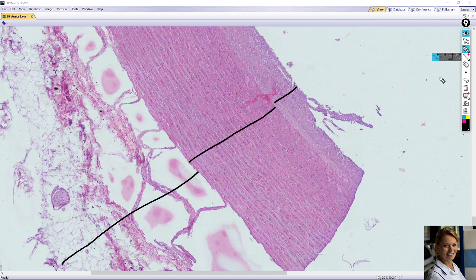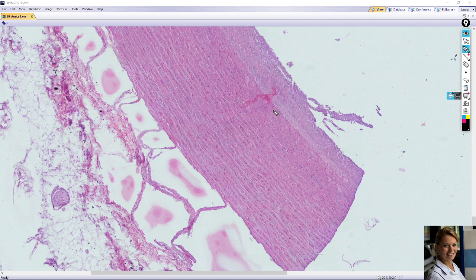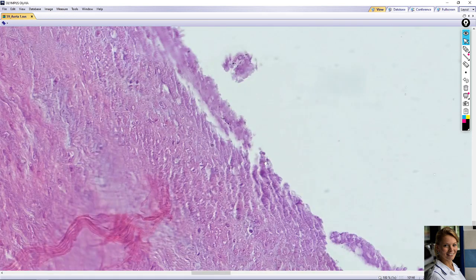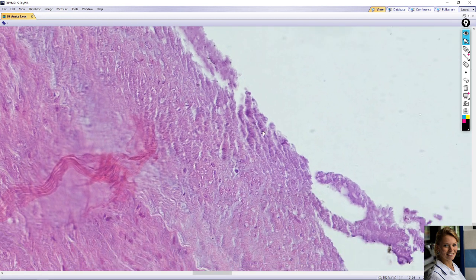The tunica intima is lined with endothelial cells. This is one layer of flattened cells with dense flattened nuclei, but these are not visible in this slide — the endothelial cells are not well preserved. Beneath the endothelial cells you can see subendothelial loose connective tissue; in this case the subendothelial tissue is very abundant.